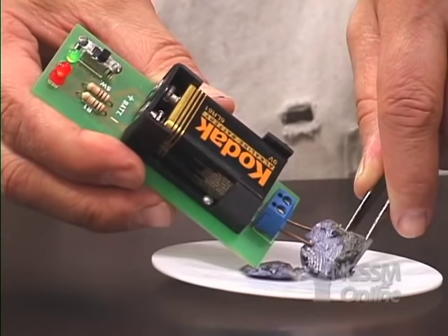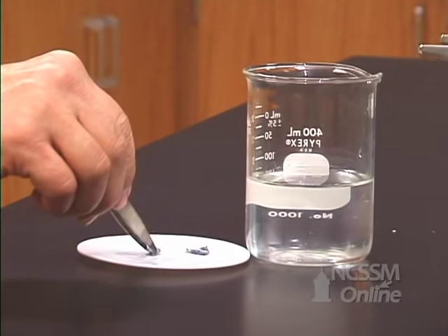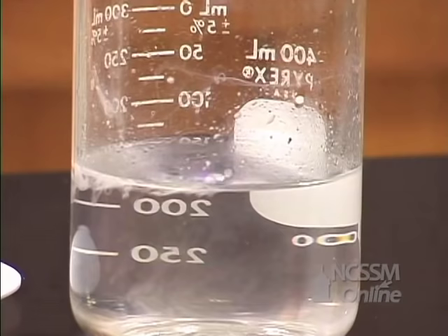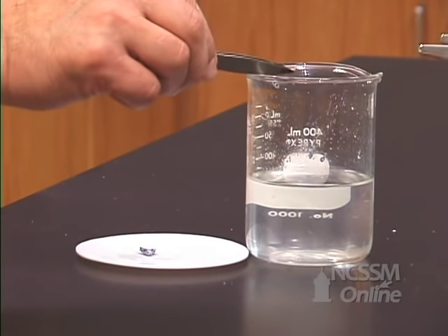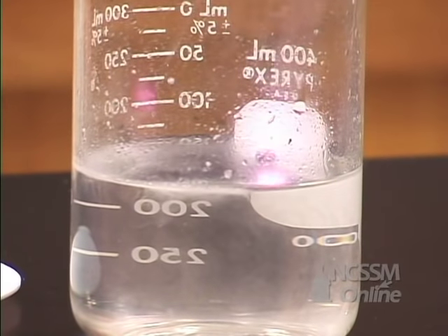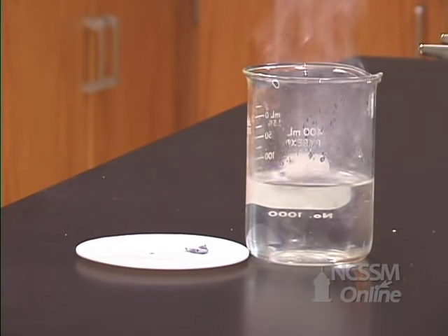The potassium is a metal and is an excellent conductor of electricity. If we add a piece of potassium metal to water, we see that it reacts much more rapidly with the water than the sodium. As you go down the column, the ionization energy decreases and the metal reactivity increases. The reaction is very exothermic and the hydrogen that is produced ignites.